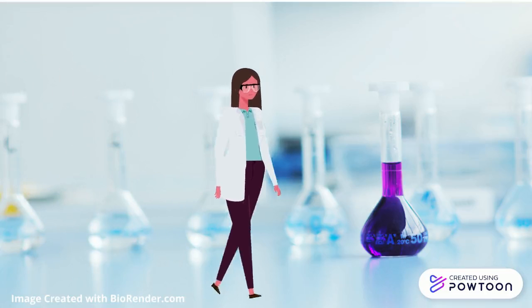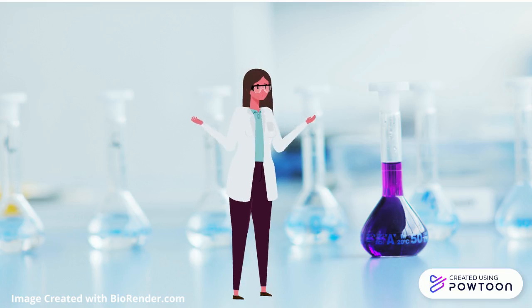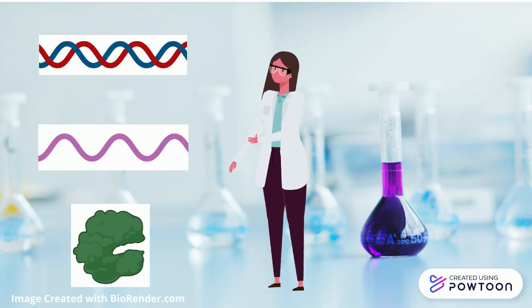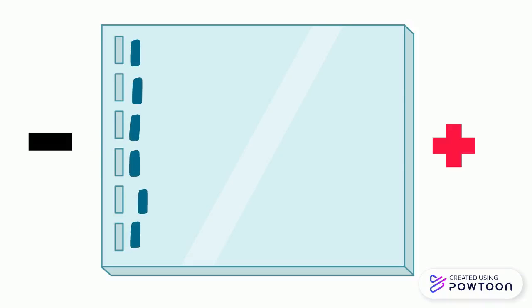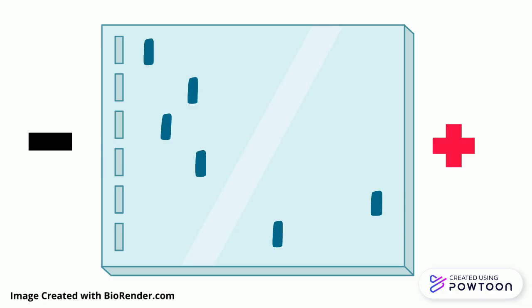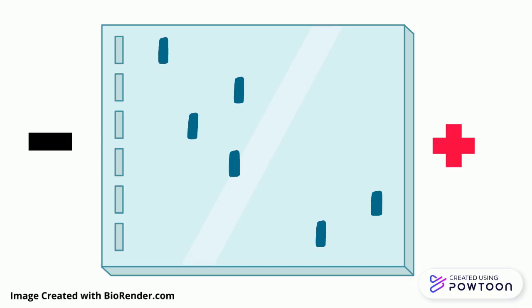This technique allows you to take the substrates that you have collected throughout your experiment and identify and separate out macromolecules such as DNA and RNA fragments, as well as proteins, to help you identify the contents and relative amounts within your substrate. Electrophoresis uses the induction of an electrical current causing negatively charged macromolecules to move towards the positively charged electrode. Shorter fragments will travel more rapidly, traveling farther through the gel, whereas the longer fragments will remain closer to the origin of the gel, resulting in separation based on size.